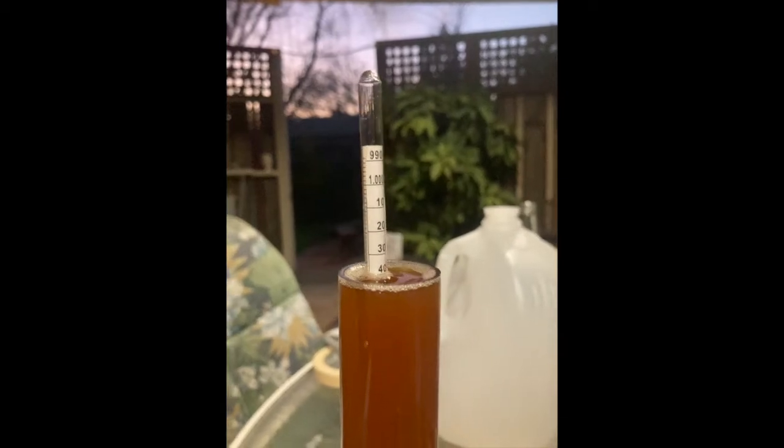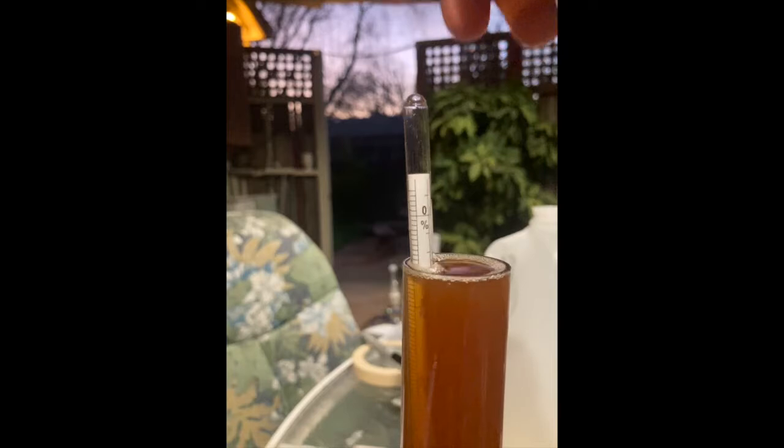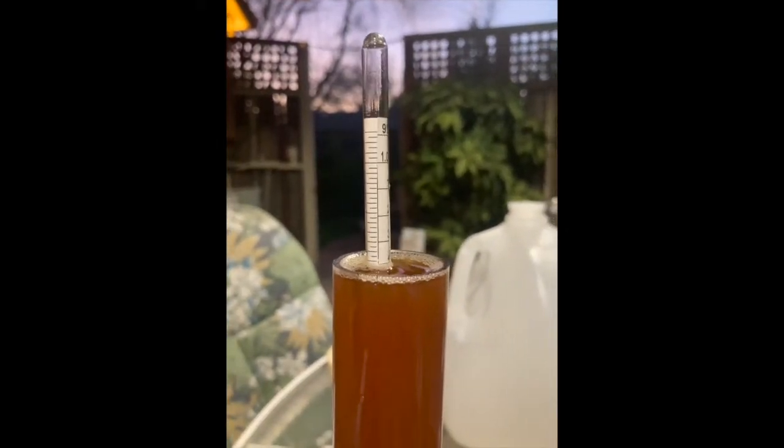So as you see this thing rotating and coming to a stop, it's right at about 1.040. So it's going to bob up and down a little bit, but horizontally you're going to see it level off at that mark.